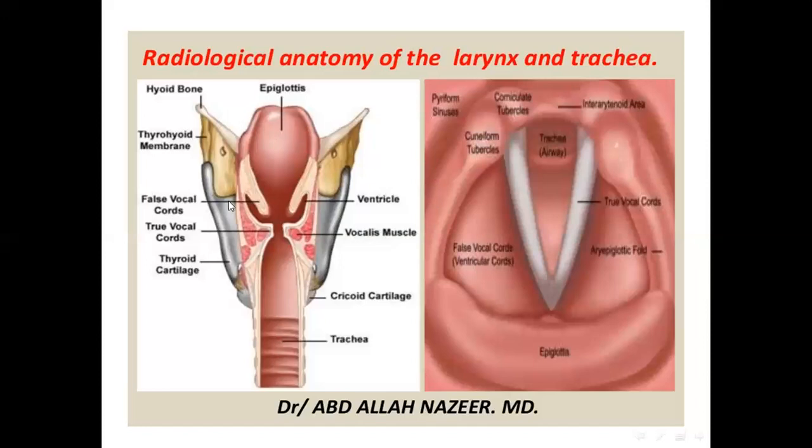Okay, here we have skeletal muscle. We have the lumen of the larynx characterized by two pairs of shelf-like folds, the superior one being the vestibular fold. Here we have the vestibular fold. Okay.